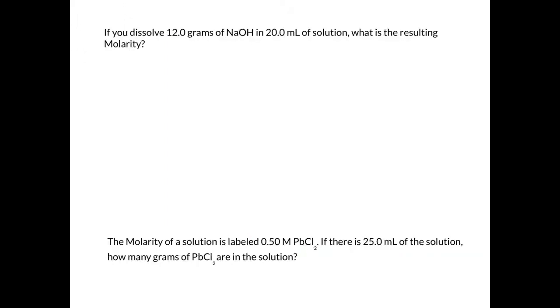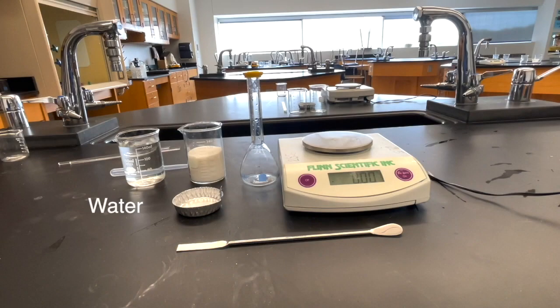Now this video clip comes from a lab that I recorded, but it applies here because it's going to show you the steps that we use in order to make a volumetric solution. So you can see we've got our solvent, water, salt is our solute, and this glass piece right in the middle is called a volumetric flask.